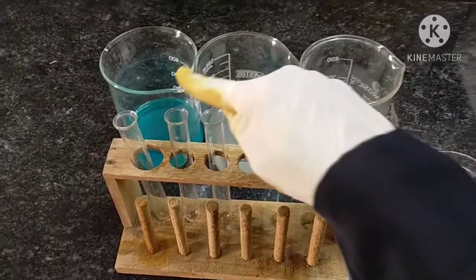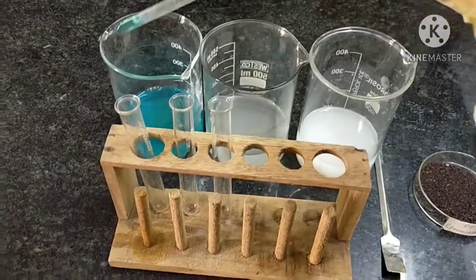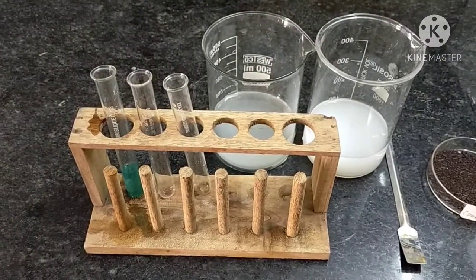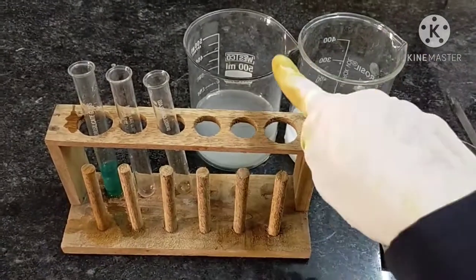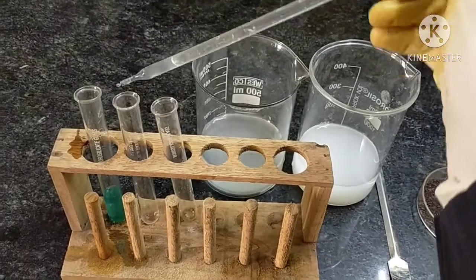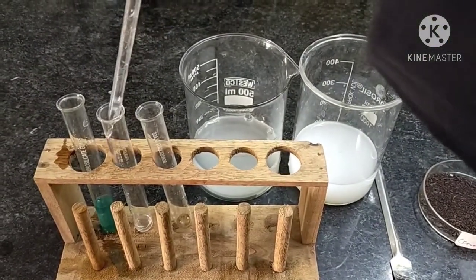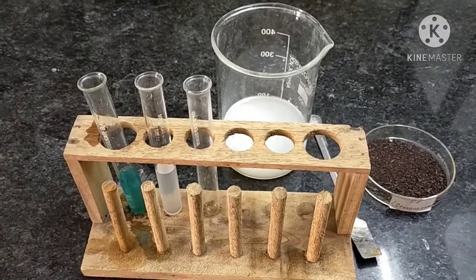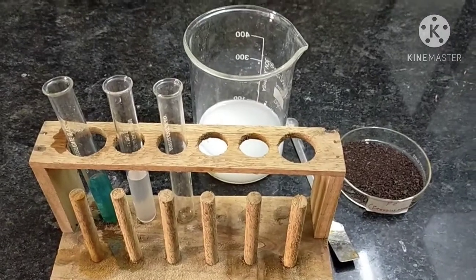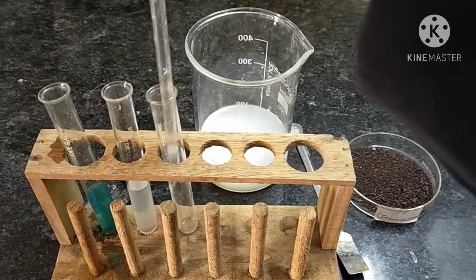So here we are going to take first copper sulfate solution in the first test tube. Take a dropper and add a few ml of copper sulfate solution and pour into the first test tube. After adding copper sulfate solution in the first test tube, now we will add zinc sulfate solution in the second test tube. Take a dropper and add a few ml of zinc sulfate solution. After adding two different salt solutions, now we will add aluminum sulfate solution in the third test tube. Take a dropper and add a few ml of aluminum sulfate solution and pour into the test tube.